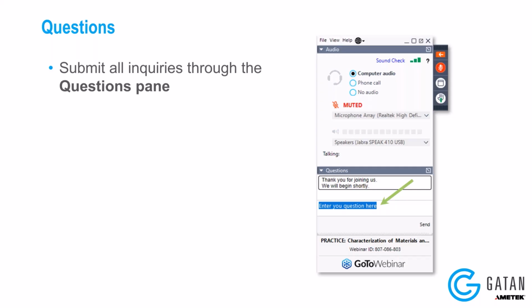So the faster the camera you have, the faster you can acquire your 4D-STEM data. That's the biggest factor to consider. Then the other thing is, when you think of this as a sequential tilt approach, how many tilts you want to use. That's why I was showing that you get a huge jump with, for example, only 5 tilts and a smaller increase in confidence index going to 10. So using the smaller, faster, rougher acquisition conditions still gives you good results. That means you can acquire data pretty quickly too.